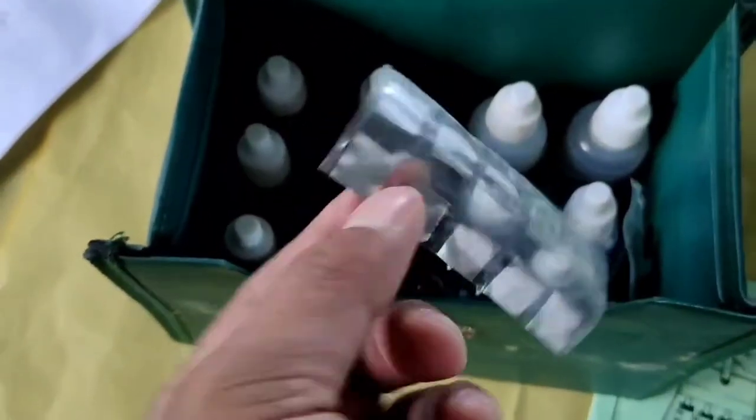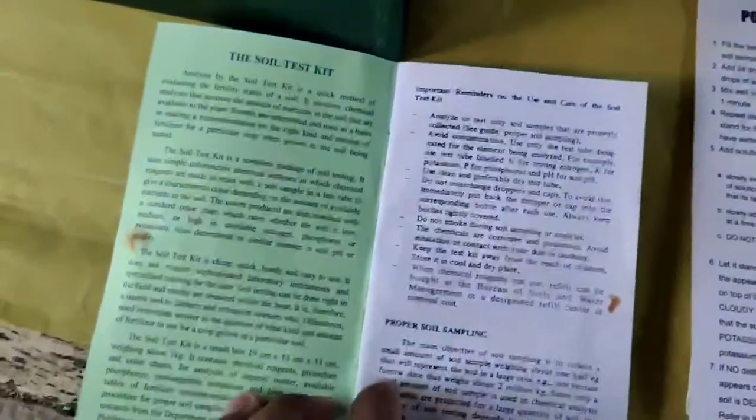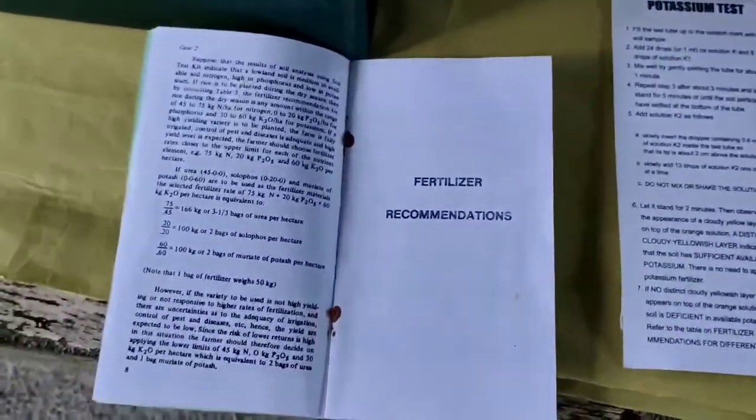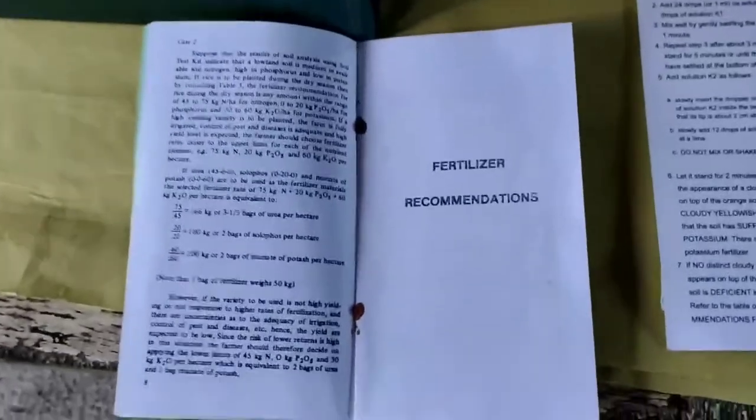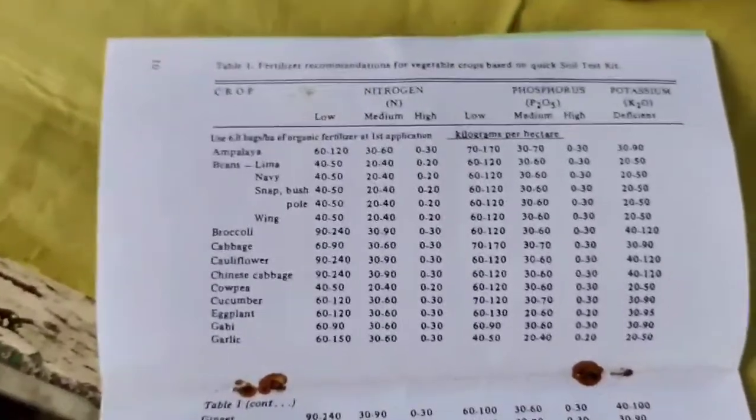Ginagamit sa phosphorus analysis test. And then we have this soil analysis and fertilizer usage booklet. Nakalaga dito yung mga paano gamitin yung soil test kit natin, mga proper soil sampling, at saka may fertilizer recommendation din. Yung mga analyze natin ng mga lupa ay nandito. Kompleto na ito. Ito na yung mga indicator niya.